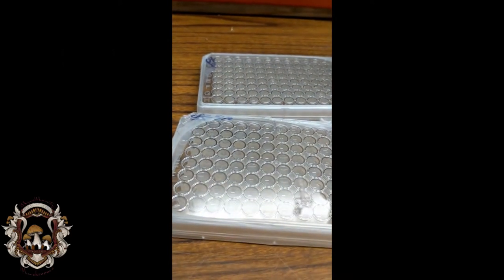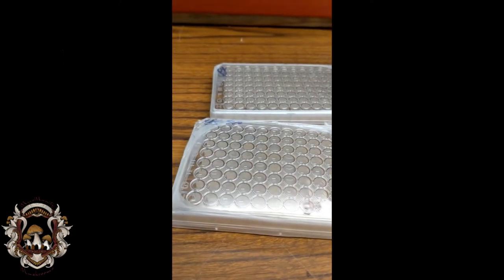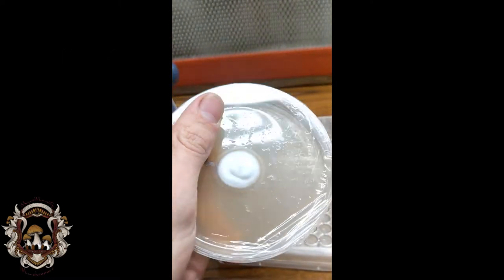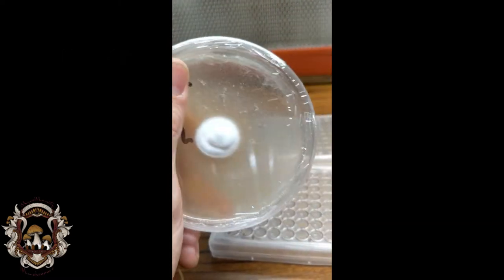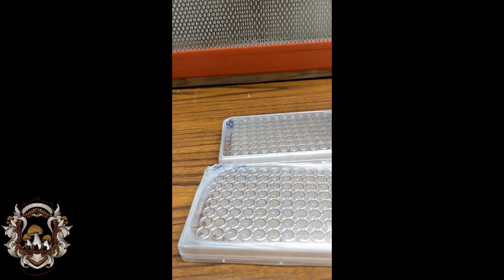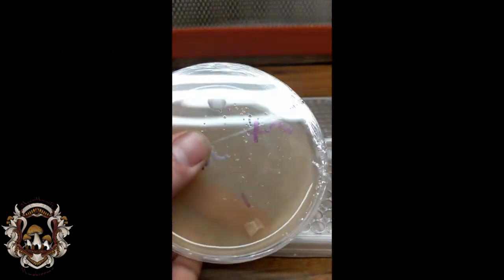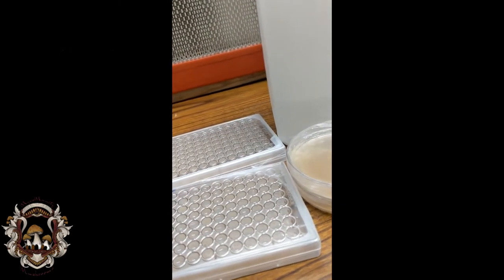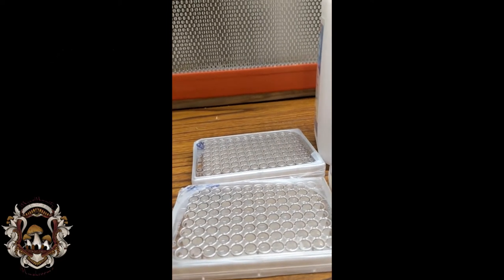Also, we are going to be viewing for clamp connections on the potential monocaryons that were selected. Honestly, I only chose, I think, three from one and two from another.